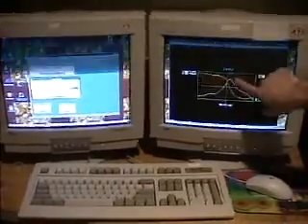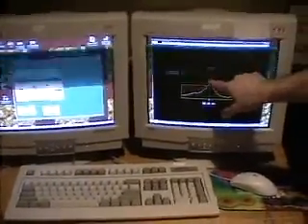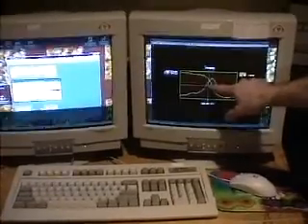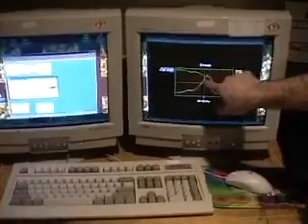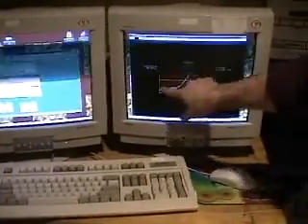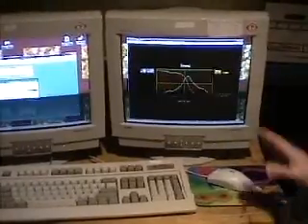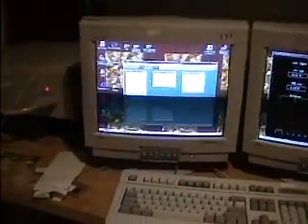So that, again, the center of the graph is slightly to the left of the peak. The horizontal line is positioned so that the intersection is at a point that's below the white line, but not too far, not too close to this baseline level. Once I've got that, I go back over to this screen and click on back to image mode, and now I'm ready to approach.